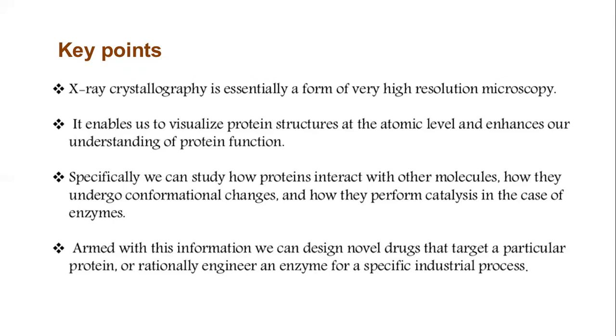And it is not just in the medical field that this is important, it is also important in engineering as well as material science and also in specific industrial processes. So, this is all about how X-rays, X-ray diffraction, and X-ray crystallography help us understand the biomolecules in detail.